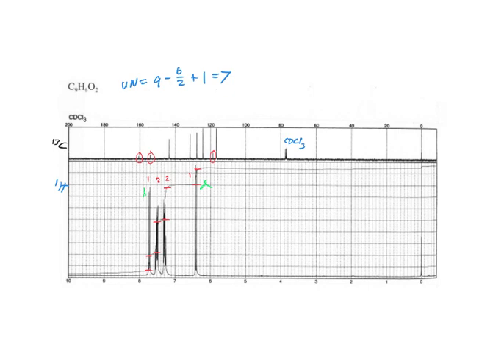Their coupling constants are very different. Very different? Oh. So they're very similar. Do they look really different? Sorry, I was trying to put the doublets as the 2 farthest away ones and the 2 in the middle on the left. No, the 2 on the outside. Right. I would think that they look about the same. Yeah. So what would that say? It means they're coupled to each other, right?